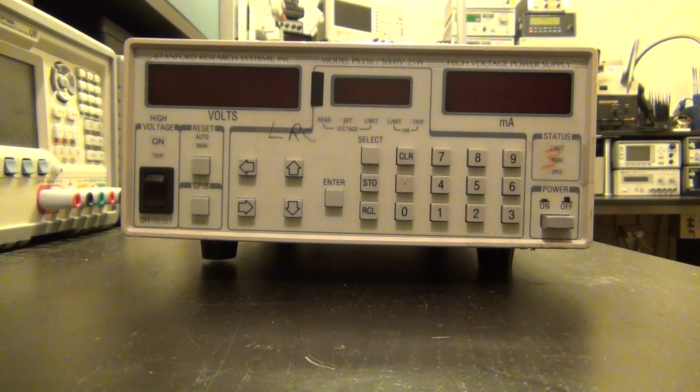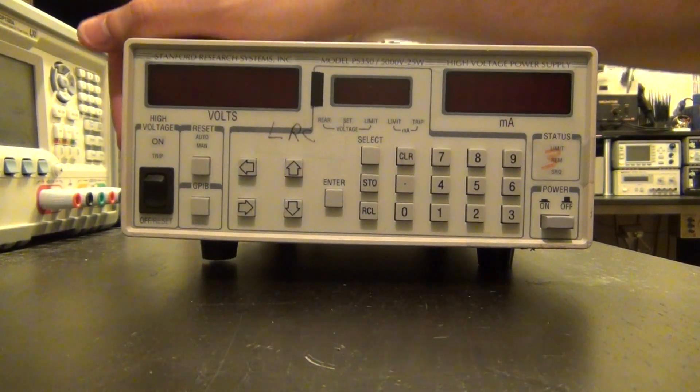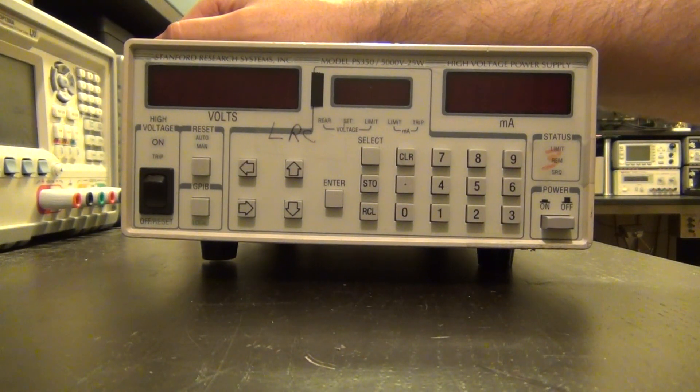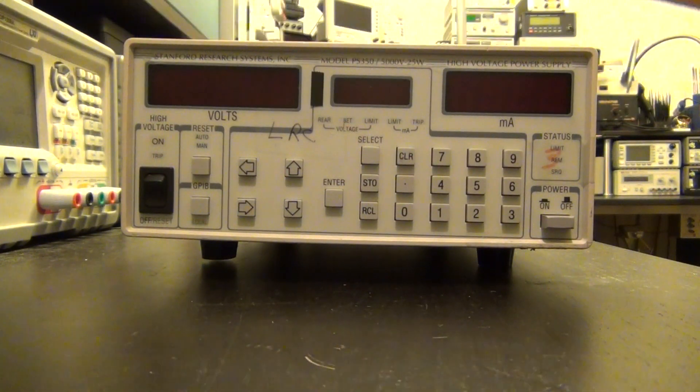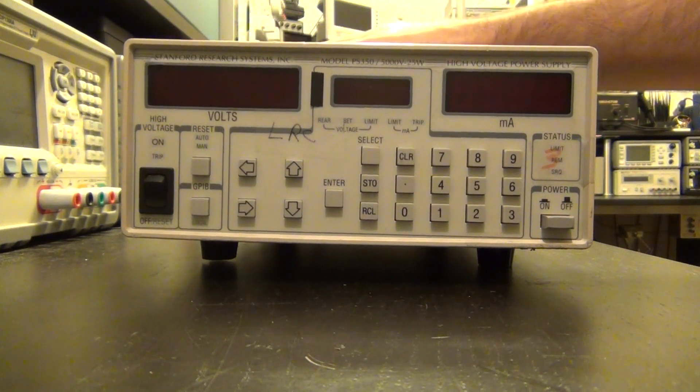Welcome to the Signal Path. I have here a Stanford Research Systems model PS350 high voltage power supply. This is the last item I picked up on eBay as part of a series of repair videos I wanted to do. I'm going to go back to a couple of reviews after this, and a few tutorials I've really wanted to do, but this is the last instrument left on the repair list.